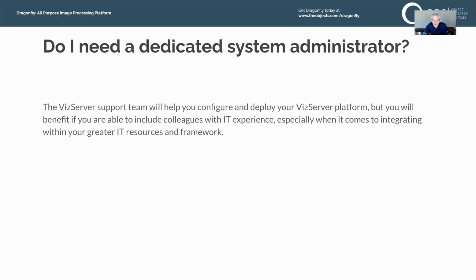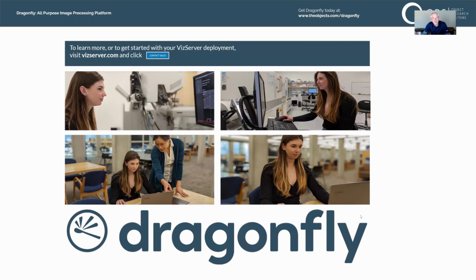Well, the VizServer support team will help you configure and deploy your VizServer platform, but you would benefit if you're able to include colleagues with IT experience, especially when it comes to integrating within your existing IT resources and framework. So we'll work with you, but there will be pain points if you don't have IT experience. So let us help you in any way we can. That's it for the questions.